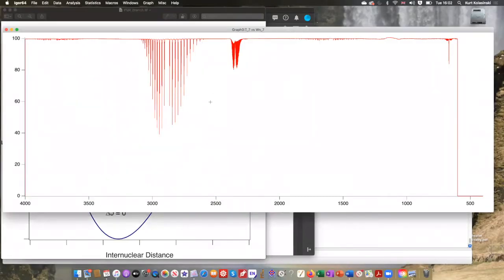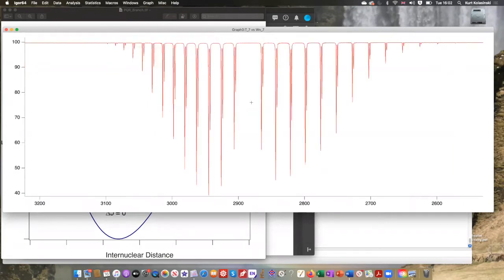Let's go back to the spectrum. This is the HCl region. This is the CO2 region. This is actually a stretch from CO2. It has the same P, no Q, R structure. This is a bend, and that bend is doubly degenerate, and it does actually have angular momentum associated, and therefore the Q branch is allowed. Let's take a look at the HCl region. The HCl region is very interesting.